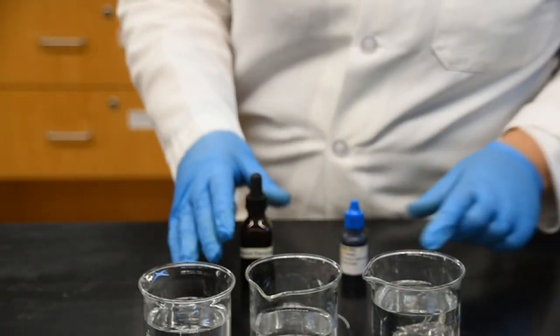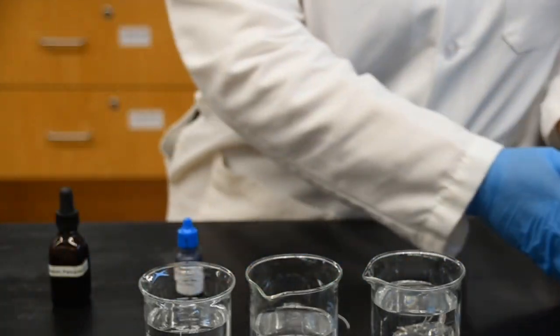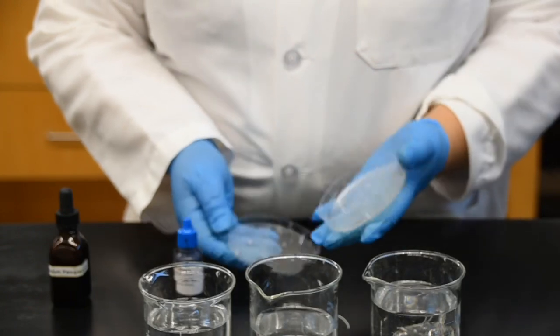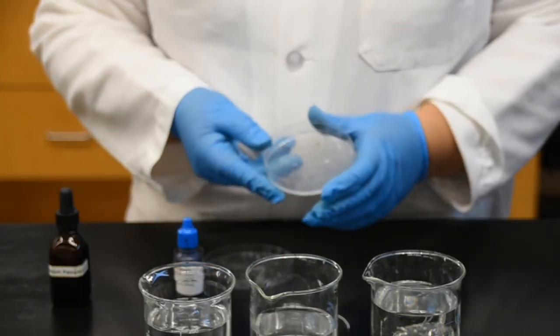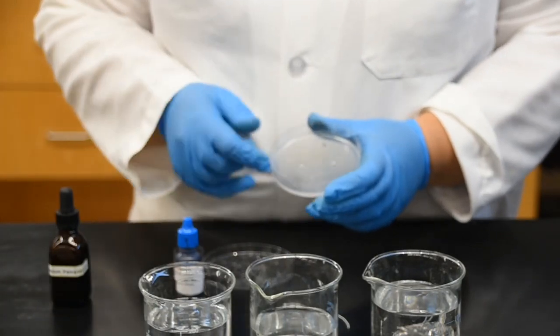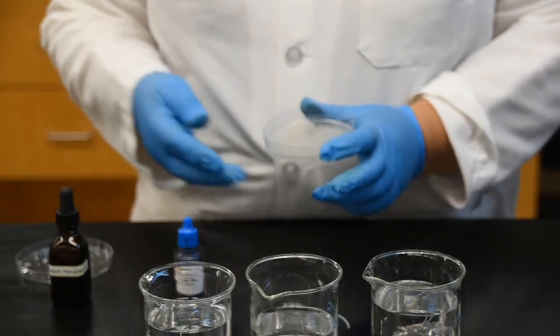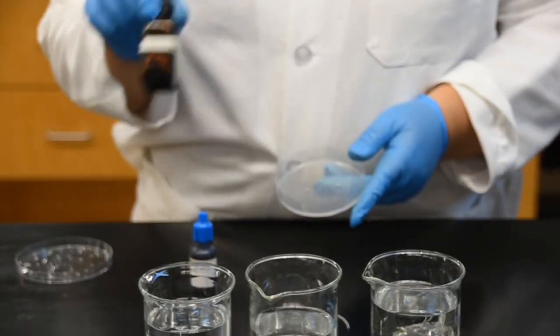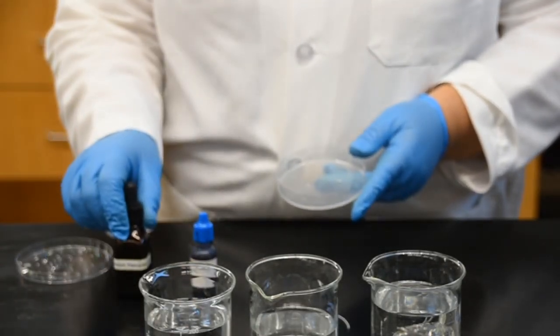Now what you would normally do is you will grab a plate. So this plate contains agar gel in it. And if I turn it around, and I don't know if you guys can see that or not, but there's two little holes inside this gel. Now what we're going to do is we're going to add a small drop of methylene blue to one of these openings, and then potassium permanganate to the other one.